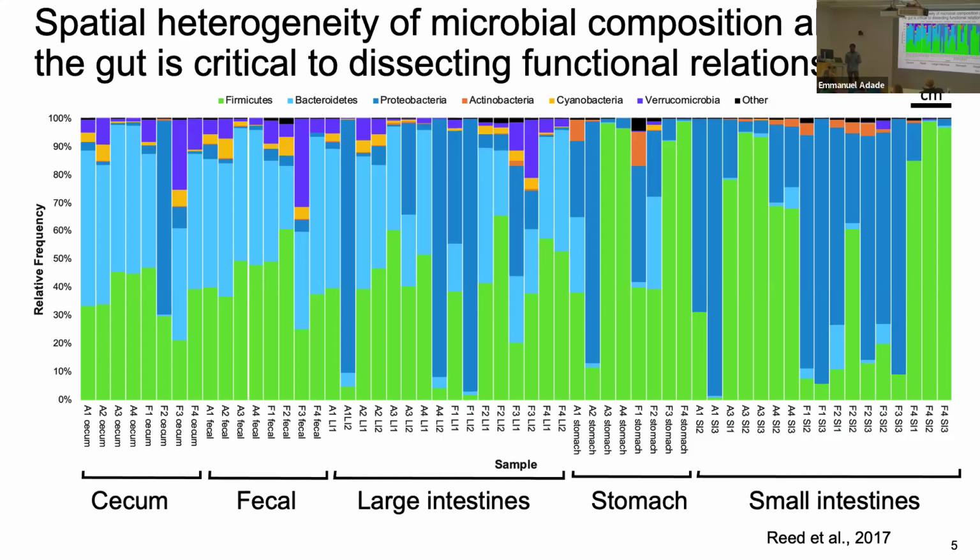So when we want to study the microbiome, we have to think about a holistic approach. And we think that our model systems allow us to really study this native assembly of microbes in the GI because it's an accessible system and we can image the full length of the gut axis. So this scale here describes another level of variability that can exist along the axis of the gut.